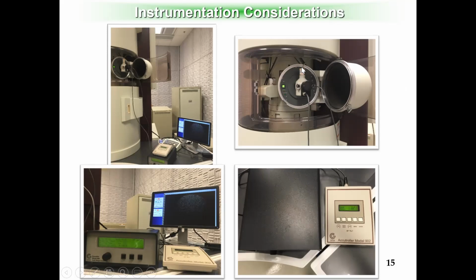We also need to stop all those bubbles. So you know that in this design, even though you have a cap on this holder, the liquid nitrogen can still contact the air, which is room temperature, right? So you will start to observe a lot of bubbles inside the liquid nitrogen. So what we do is that we have a small tube. I don't know if you can see it.